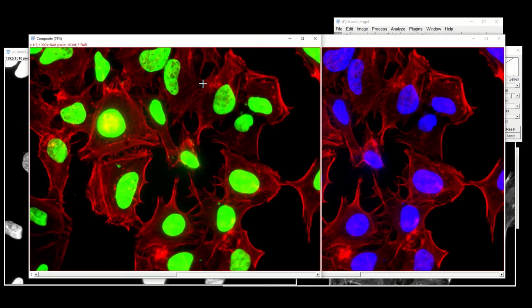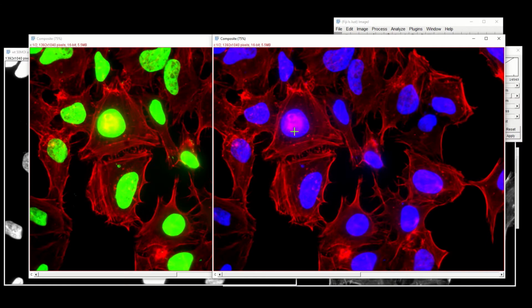Of course, you can continue processing this image, and I encourage you to continue playing with all the sliders and all the features. Eventually, what you should really do is export or save one of these images as a TIFF file, and export it into PowerPoint or Illustrator, whatever software you make your figures in. I also want you to zoom in on a particular portion and make it more visible. It's really up to you whether you choose red and blue channels or green and red channels. It doesn't really matter. Just keep in mind that all of these colors are pseudo colors, not true colors.